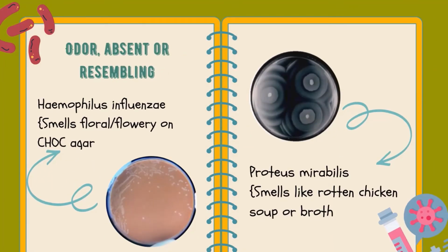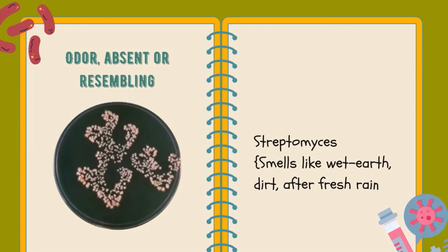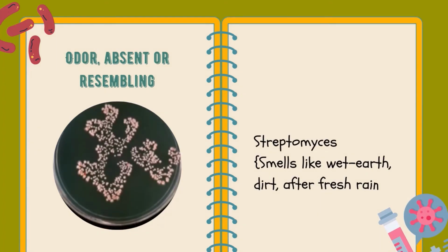Haemophilus influenzae smells floral, flowery on chocolate agar. Proteus mirabilis smells like rotten chicken soup or broth. Lastly, we have Streptomyces, which smells like wet earth, dirt after fresh rain.